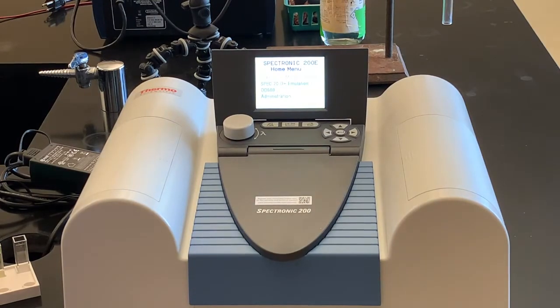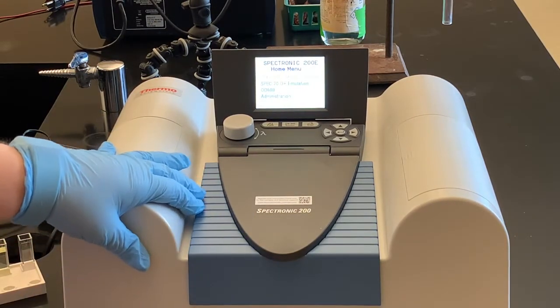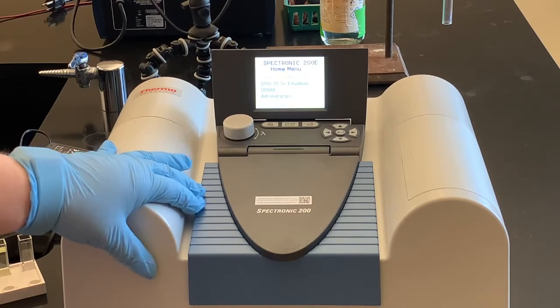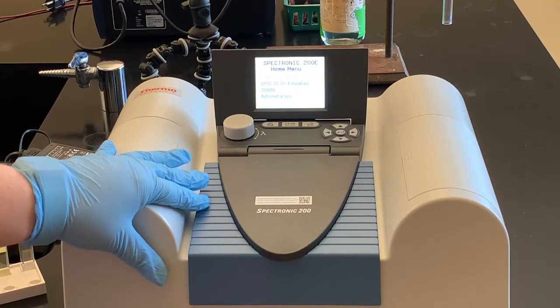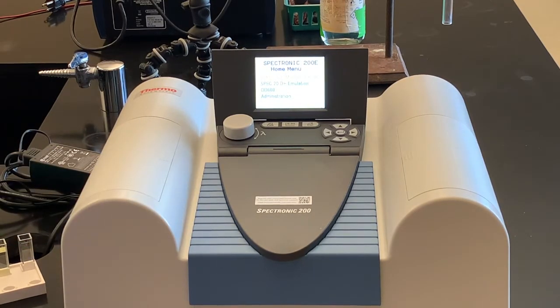For the cuvettes I need some chem wipes because I want to wipe off any fingerprints before I put them into the Spec 20. This is a Spectronic 200 — a spectrophotometer — and we're going to use it to measure how much light goes through these solutions. You can see the directions for use of this Spectronic 200 on your handout or in the PowerPoint provided to you.